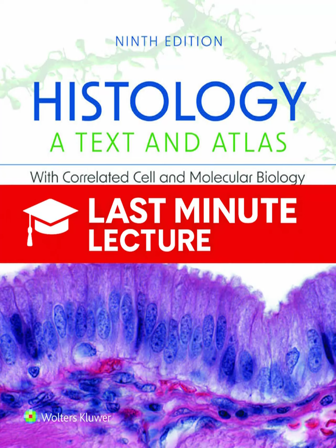And then comes the clearing step. That's where those organic solvents you mentioned come in, right? Specifically xylol or toluol. These solvents are key because they can mix with both the alcohol and the final embedding medium, which is paraffin wax. So the xylol gets rid of the alcohol, and now the tissue is ready to be infiltrated. Yep. It's placed into molten paraffin, the hot wax seeps into all the spaces within the tissue, and then you let it cool and harden. Now you have a solid, rigid block.